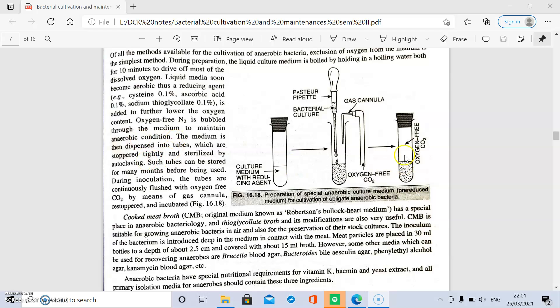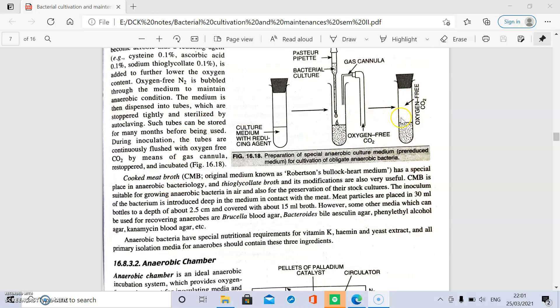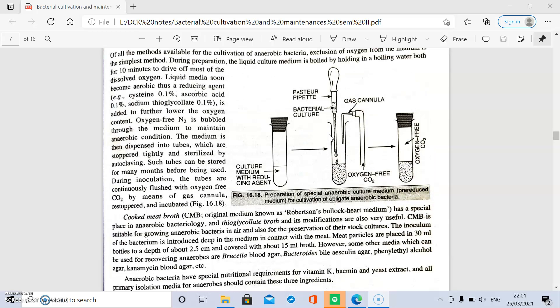The medium is filled into a tube, stoppered tightly, and sterilized by autoclaving. It can be stored for several months before use. The tubes are continuously flushed with oxygen-free carbon dioxide by a gas cannula, and bacterial inoculation is performed by a Pasteur pipette.